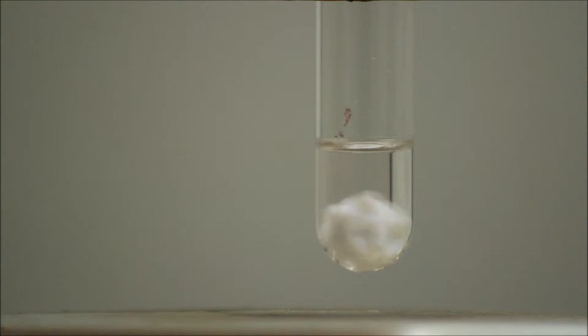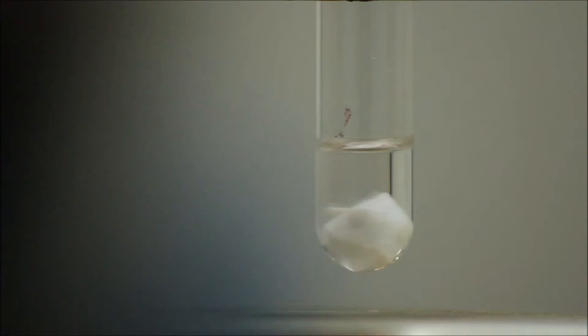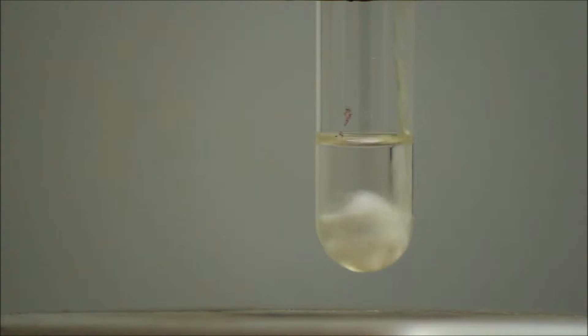When acetone is used in this aldol condensation, a secondary product is obtained from a secondary aldol reaction. This product suddenly appears as a yellow precipitate after a while. Thus, this reaction is known as a clock reaction, as it seems as nothing is happening until the precipitate appears all at once.